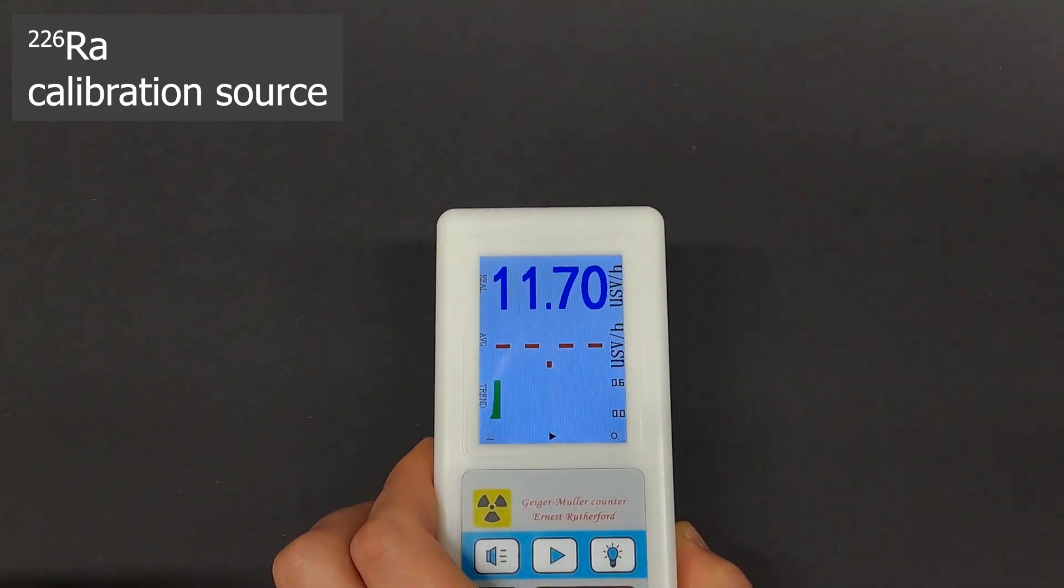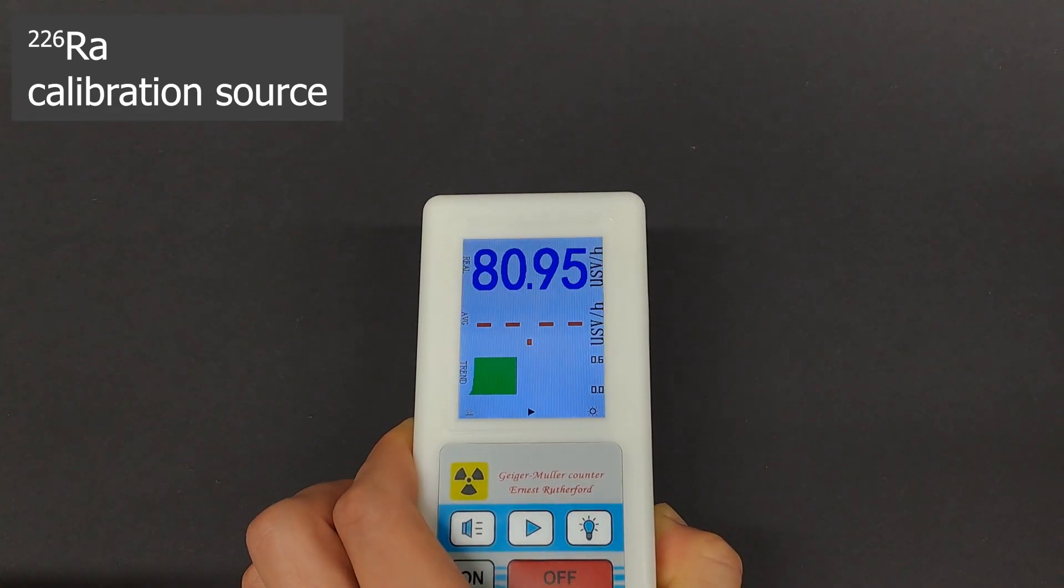For Radium-226, it measures a whopping 94.56 microsieverts an hour.